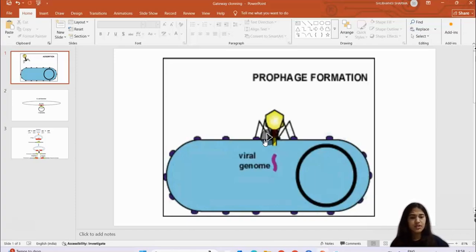It could be a PCR product because you will be amplifying it, or it can also be a product of a different vector, so you will be subcloning. After the restriction digestion, the ligation occurs, then positive and negative selection. These are all the methods. Then you screen for the recombinants which have your insert, and then you get your clone product.